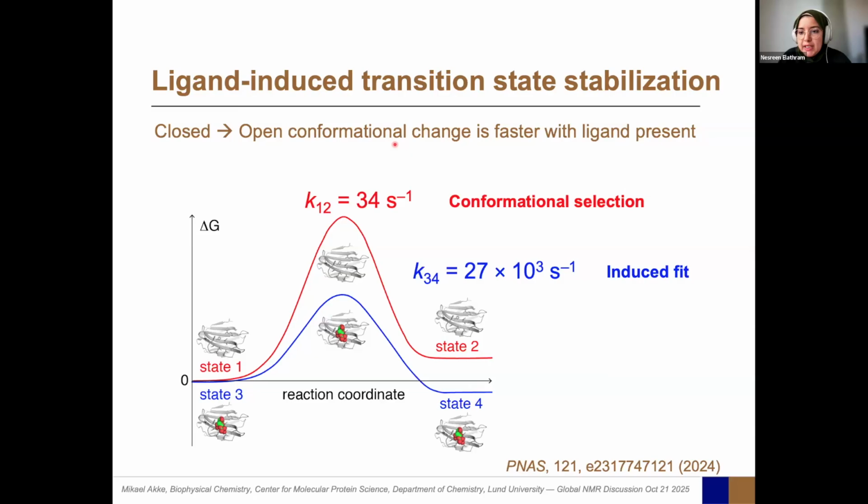Actually, last question from Julie. Would this work for any KD value, or is there a range where this approach would perform better? I think you need to have a system where you will get relaxation dispersion due to the exchange. If it's a very slow exchange, you could maybe measure it with longitudinal exchange spectroscopy and so on, and via that fit rates.